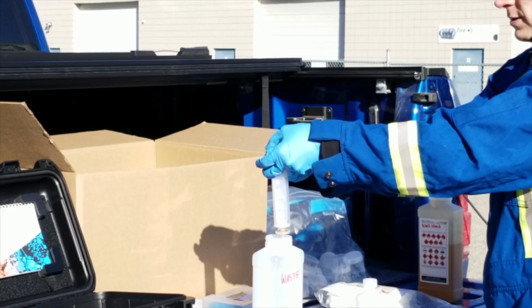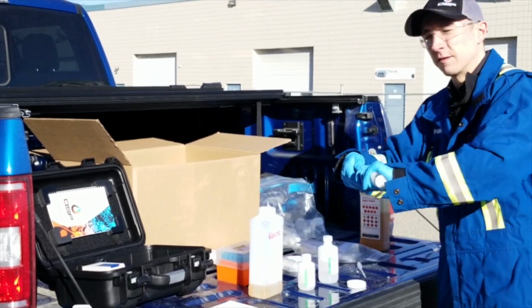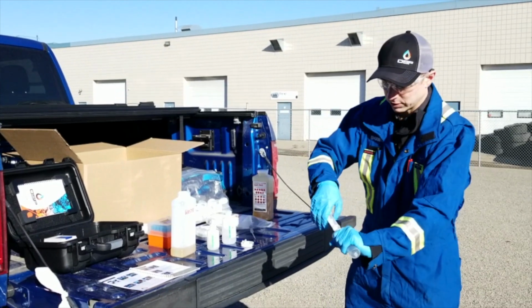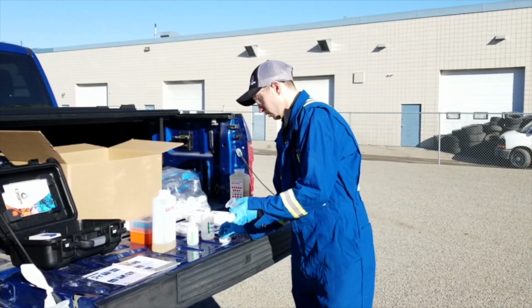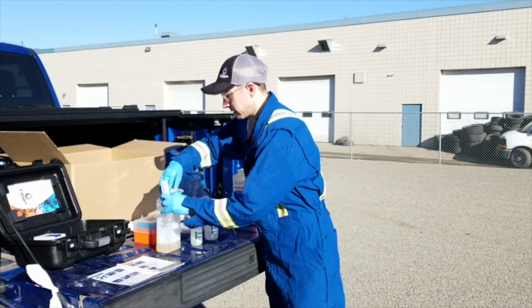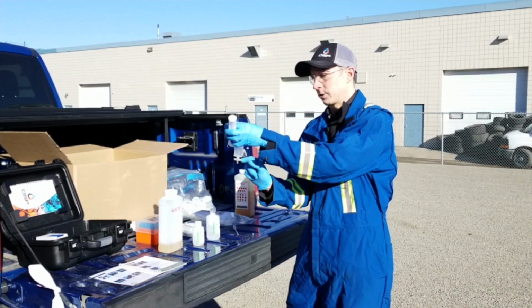Keep pushing when there's air. It just acts to sort of dry the filter. That's fine. Detach the filter. Again, take the plunger out and shake. Reattach the filter. Now what we're going to do is, again, we've got the microbes captured on the filter.